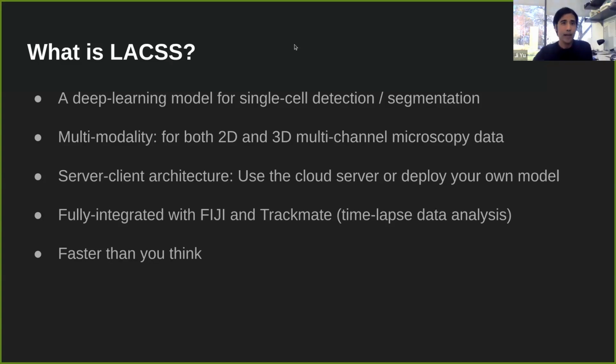So what are we going to do today? This is not going to be a very hands-on workshop where you do a lot of things. But you're welcome to follow along as Nick goes through the pipeline.